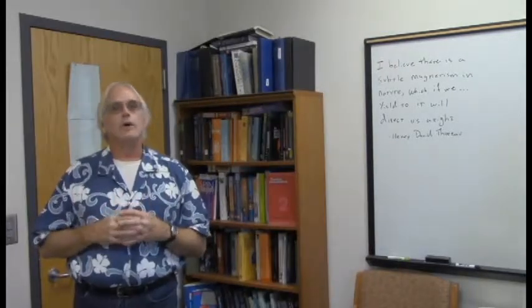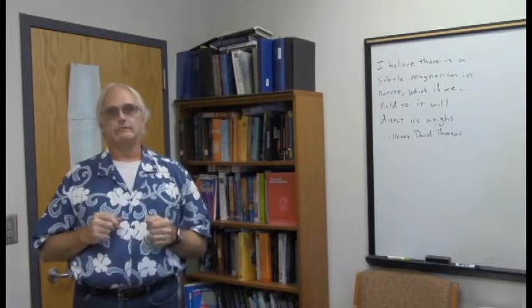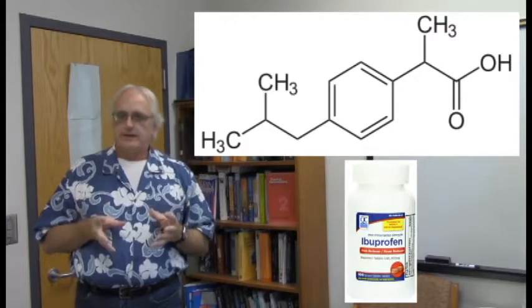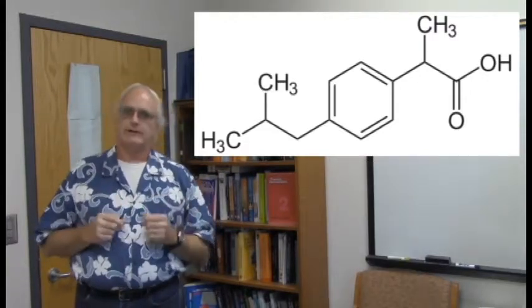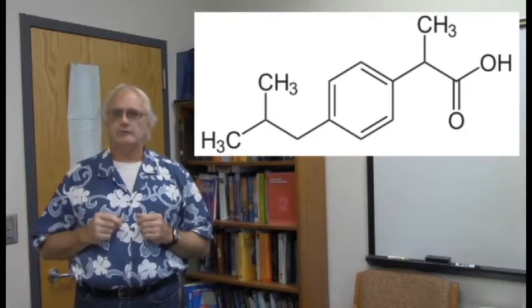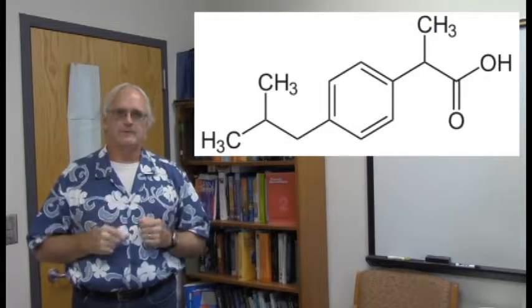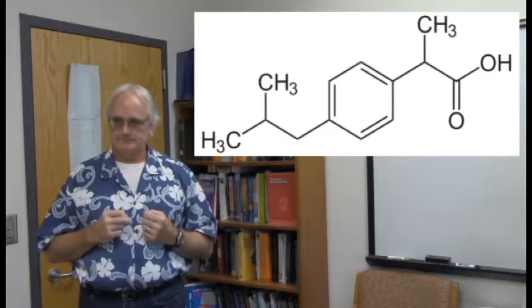And yes, there is only one reasonable molecule that we can put together from these pieces, and it is our dear friend ibuprofen, okay? One of my favorite example molecules. It is a sophisticated molecule, not hugely difficult, not terribly easy, kind of sits right there in the middle. And the COSY spectrum is really powerful. It really shows what kind of power a COSY spectrum has in helping to map out the spin systems, particularly the aliphatic spin systems of this molecule.